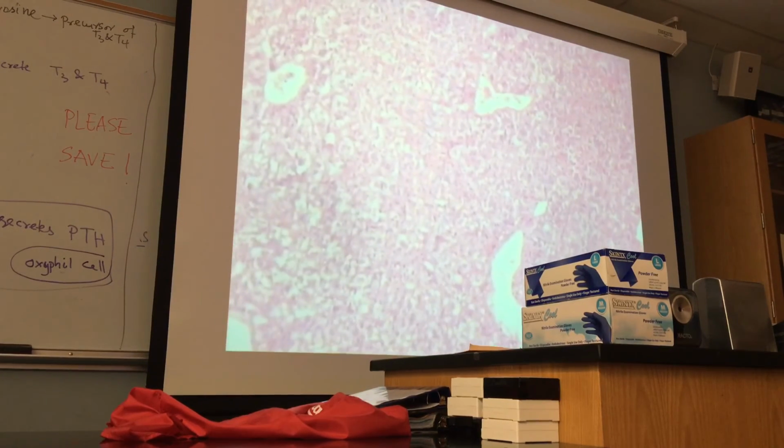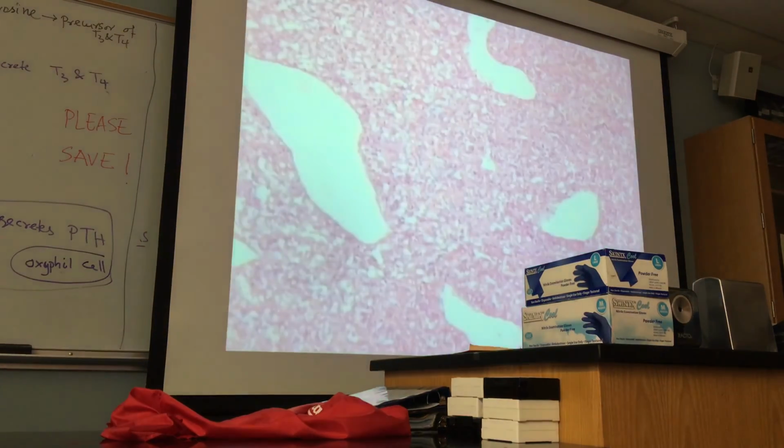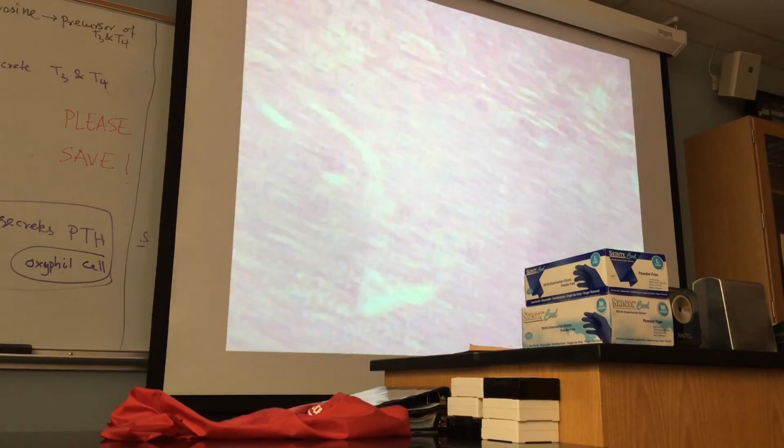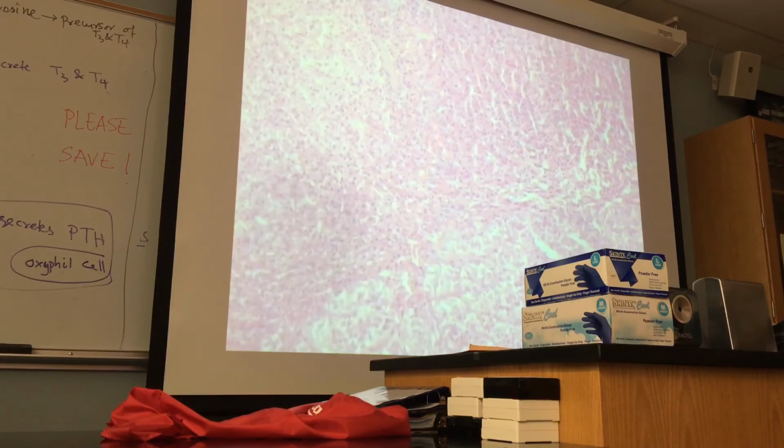And these cells surround, look here, these are sinuses. Can you see this? These are blood-filled sinuses. These cells surround blood-filled sinuses. So when you are to identify adrenal medulla, you will be given some reference. What kind of reference? You have both adrenal medulla and adrenal cortex.